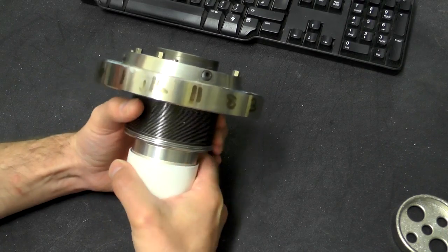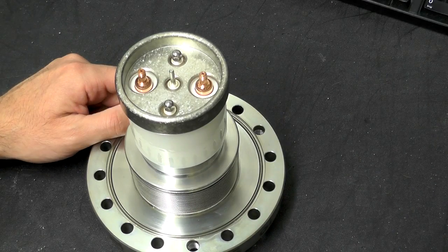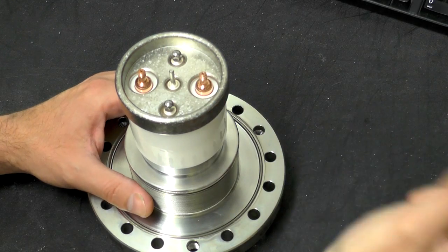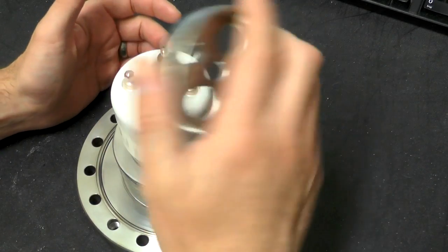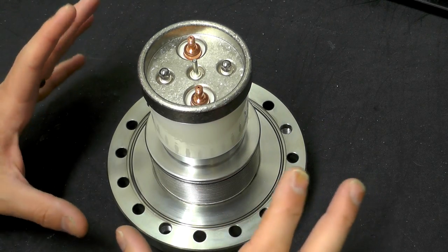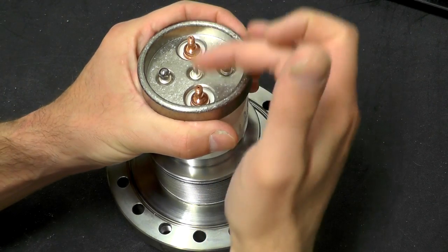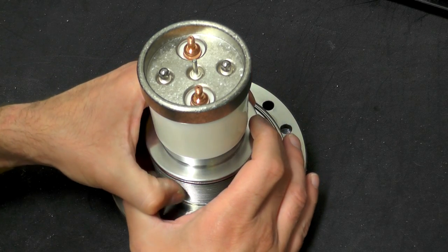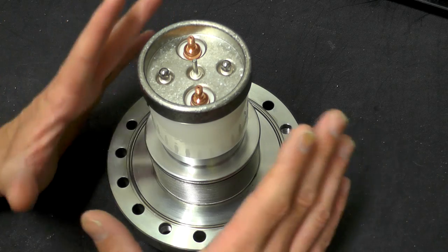That means you have to be able to gimbal this section around while still being fixed to the top section, which is completely fixed in place. There is a section of metal bellows which allows the filament itself to be moved around while still maintaining the vacuum. I have actually removed the filament from this — it's the T-shaped bit that was attached here — because it's going to a new owner very shortly, and I didn't want to damage it.